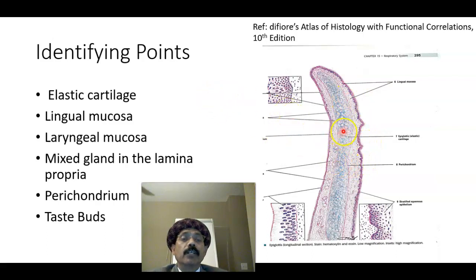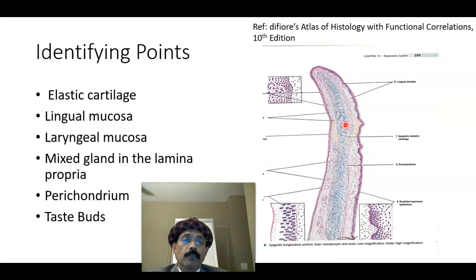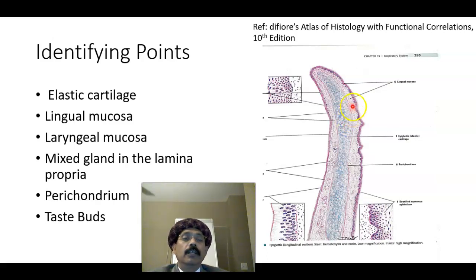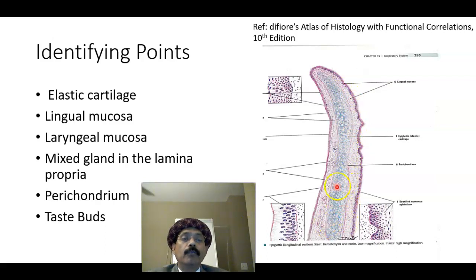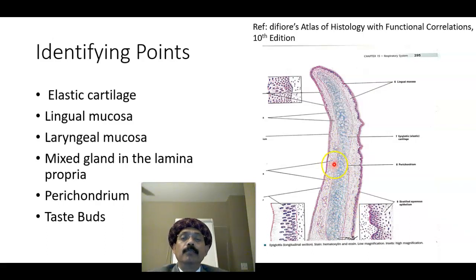Identifying points: elastic cartilage. Elastic cartilage contains the chondrocytes, the elastic fibers, type 2 collagen, and on both sides it is covered by the perichondrium. There is a dense irregular connective tissue. There is a perichondrium, and the lamina propria has glands.